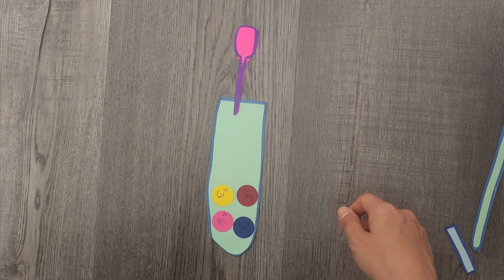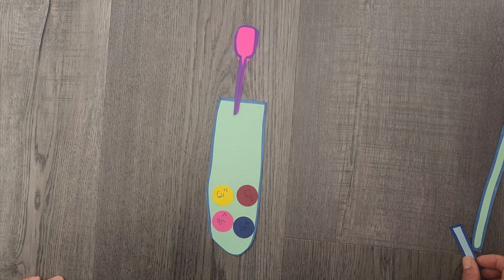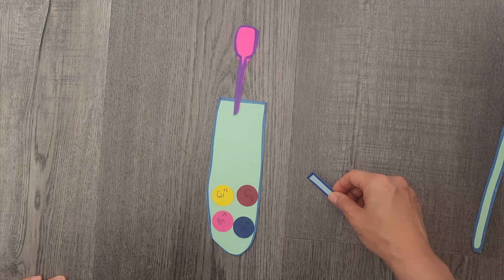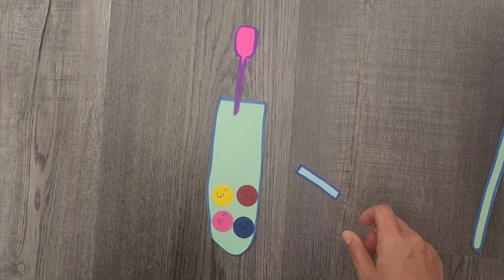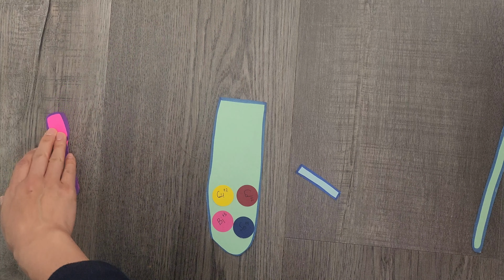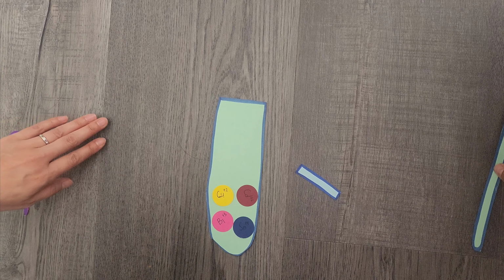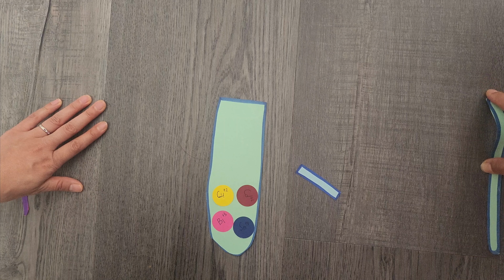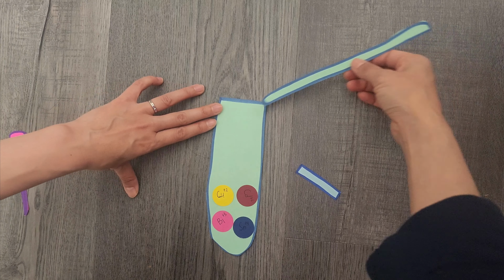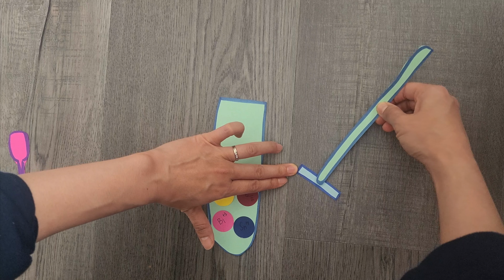Okay, and then afterwards you want to take a pH paper, and you want to make sure that the pH is also tested. So let me take out my pipette, and then I'm going to grab a stirring rod, dip it in the solution, and then put it onto the pH paper.